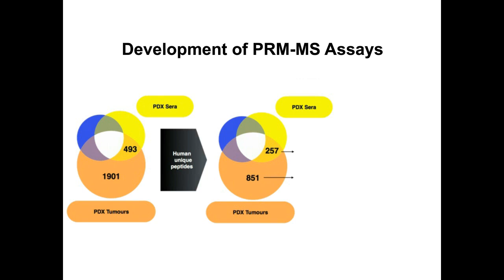So that gave us 169 peptides mapping to 146 gene products for that set of peptides found in serum as well as tumor. And it gave us way more than 223. So using these biophysical criteria actually results in about 500 peptides. So here we have to be a little bit more reasonable, since it's quite expensive to synthesize stable isotope labeled standards, even if they're not ultra purified. So if multiple peptides mapped to the same gene product, we only selected the most intense peptide mapping to that gene product. That resulted in 223 peptides, then obviously mapping to 223 gene products. So it's one peptide per gene product. And nevertheless then covered every gene product in that list of 851 human glycopeptides. So in total, that's 392 peptides.